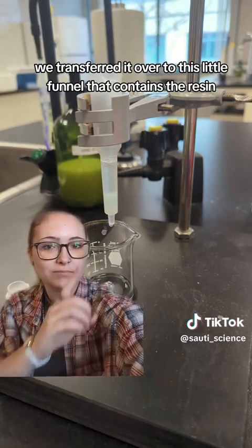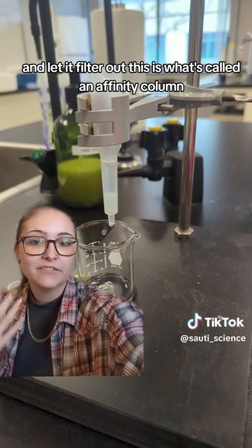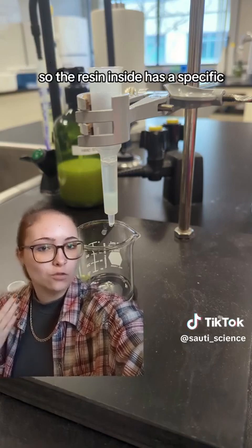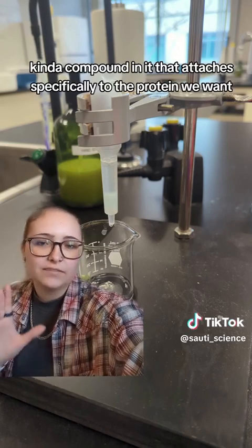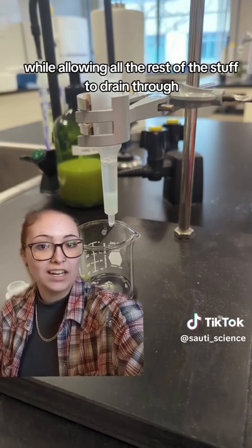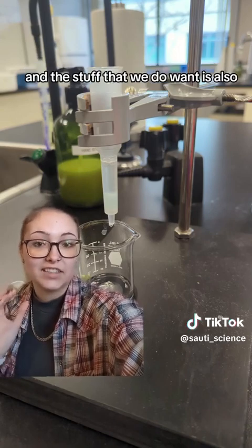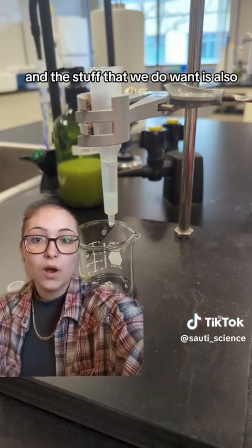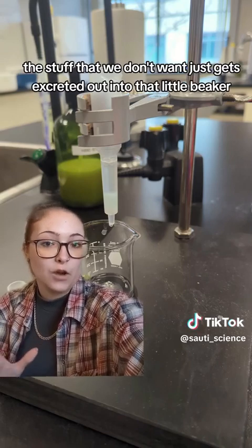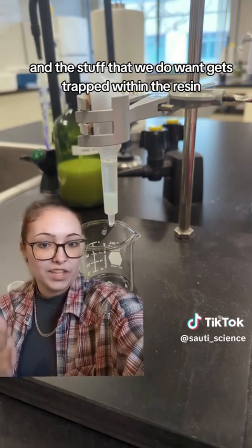After centrifuging, we transferred the solution to a little funnel containing the resin and let it filter through. This is called an affinity column. The resin inside has a specific compound in it that attaches specifically to the protein we want, while allowing all the rest of the stuff to drain through. So the stuff we don't want gets excreted out into a little beaker, and the stuff we do want gets trapped within the resin.